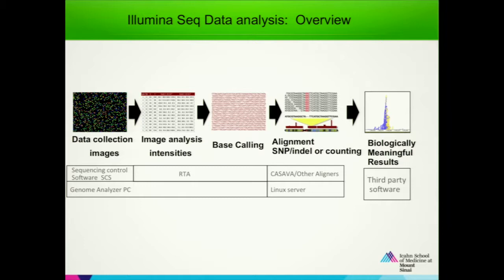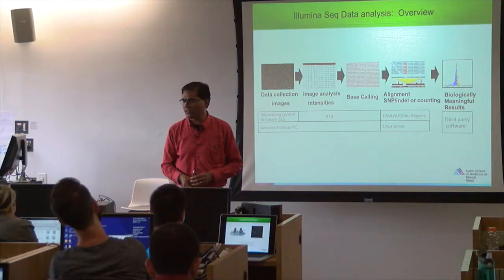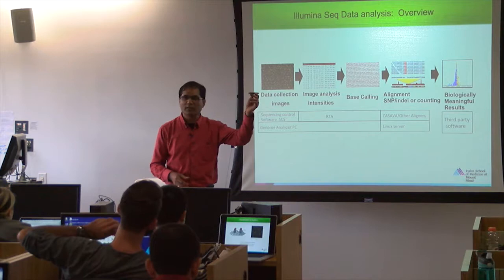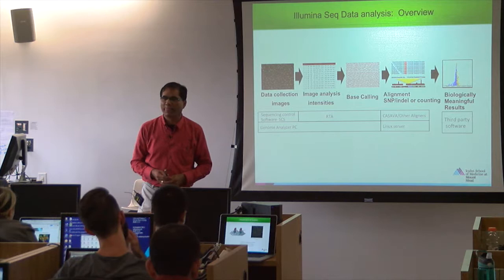300 you can sequence. If you are getting 300 million reads per lane, suppose, and if you are sequencing 300 bases, you are getting 90 billion bases sequenced. 90 billion bases comes to around 30x human genome, and that is what is a standard depth of sequencing today. That means in one slot, you can sequence 30x entire human genome. That is today's capacity, okay?